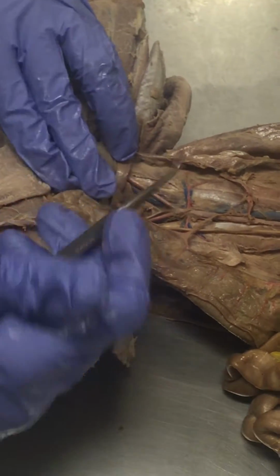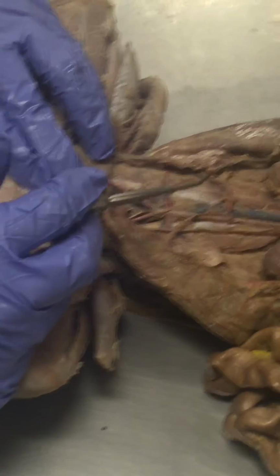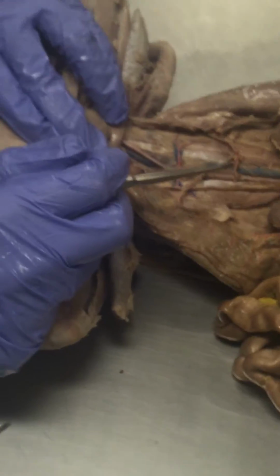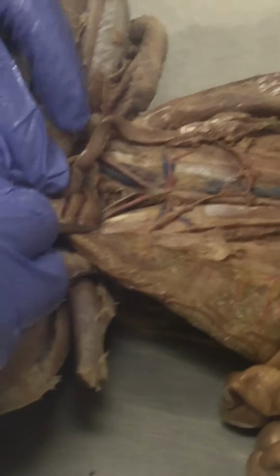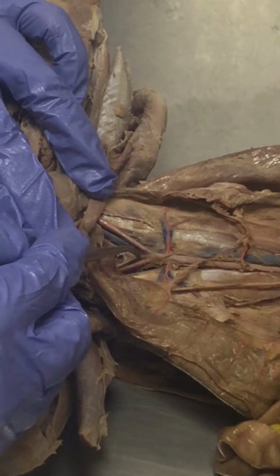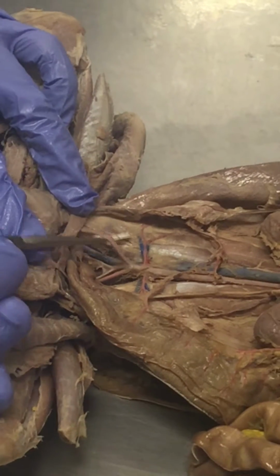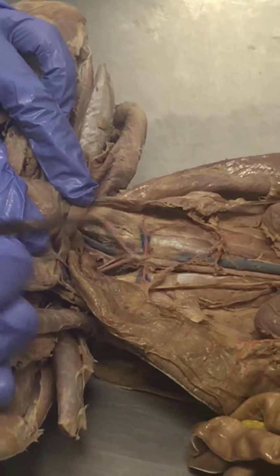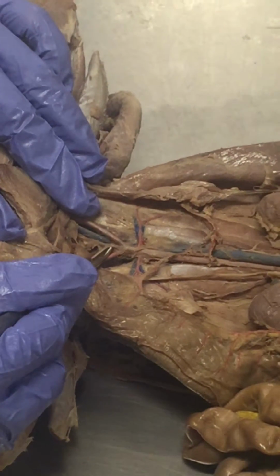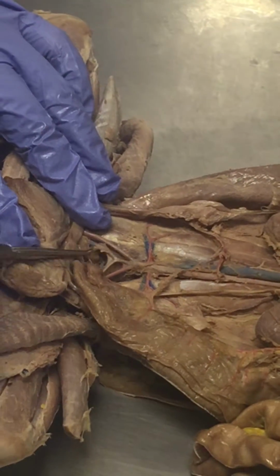Oh, this is where I forgot to tell you this. On a human, humans have common iliacs that then split into external iliacs, but cats don't have a common iliac. What happens in the cat is that the aorta splits once and then continues down a little bit more and then splits again. So this first split here, this is the external iliac. And then right here we've got the aorta continuing down a little bit more, and so this right here is the internal iliac.